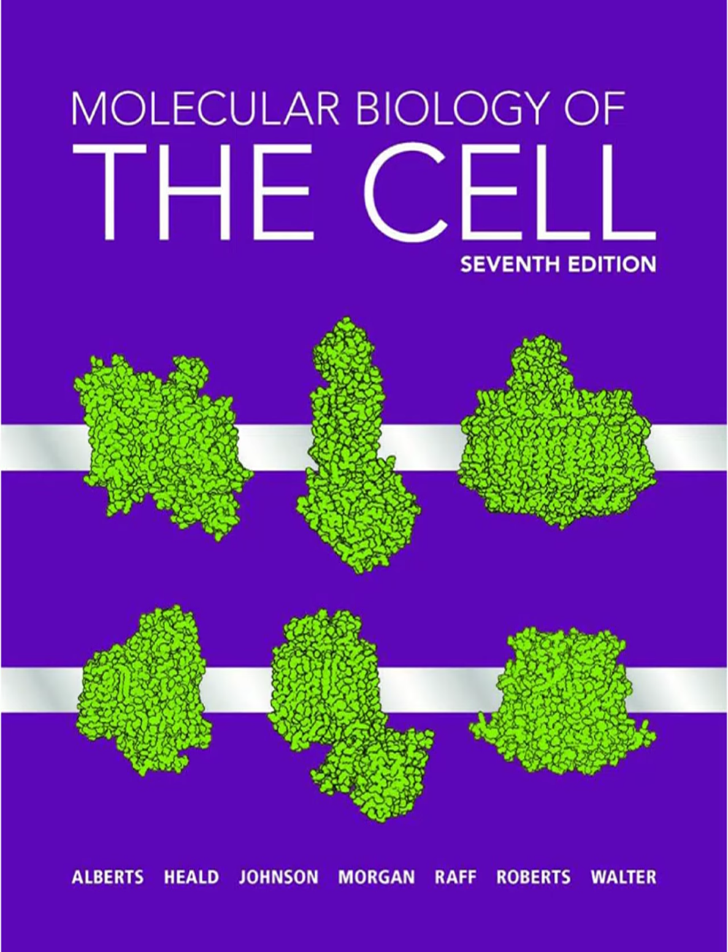Wow. Does that need special dyes? Yes, it generally requires dyes that can handle this depletion process efficiently. But the resolution is fantastic, revealing structures like the details of nuclear pores. 20 nanometers with light. Okay, and then there's the single molecule approach, PALM and STORM? Right.